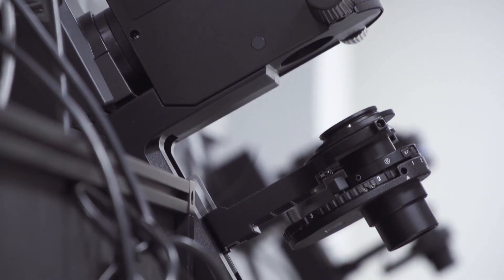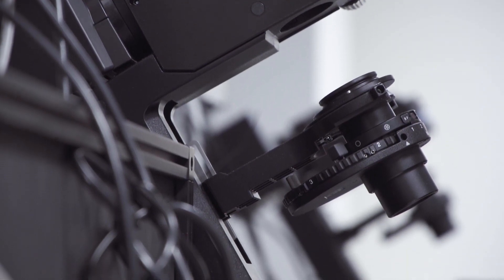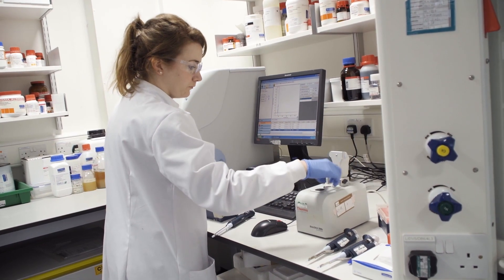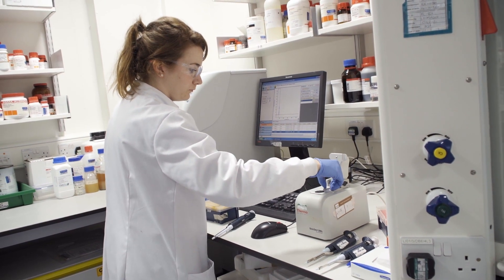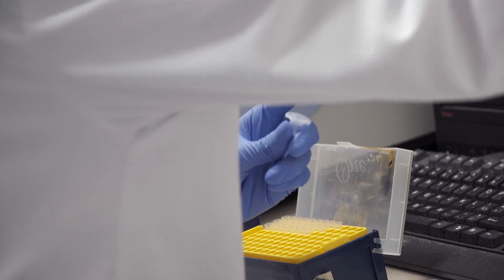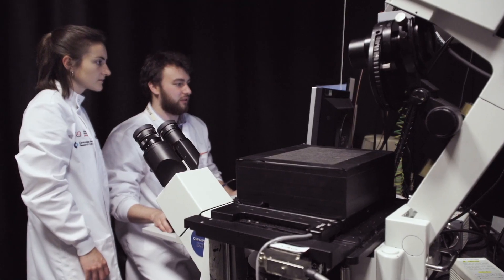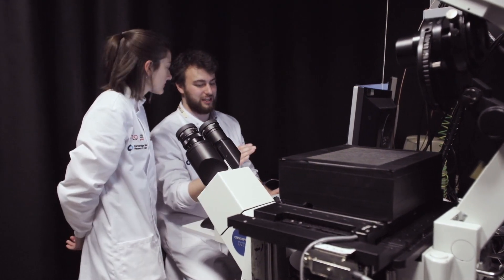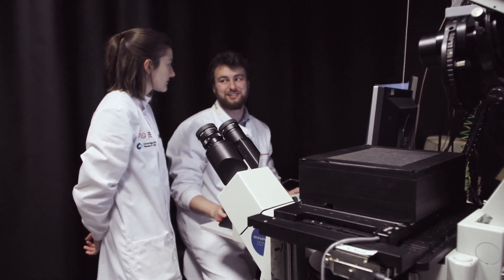Using our super resolution microscope we're able to look closer than we've ever been able to look before, meaning we can see the mechanics of these diseases and hopefully come up with cures. We're discovering things that haven't been found before, how Parkinson's disease develops and how we can stop it. It's great as an engineer that we can use our technological skills to contribute towards curing neurological disorders.